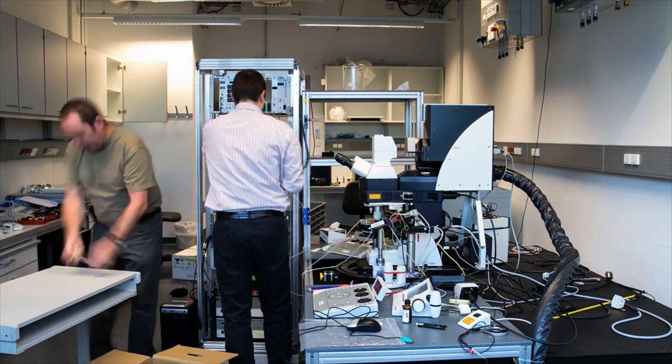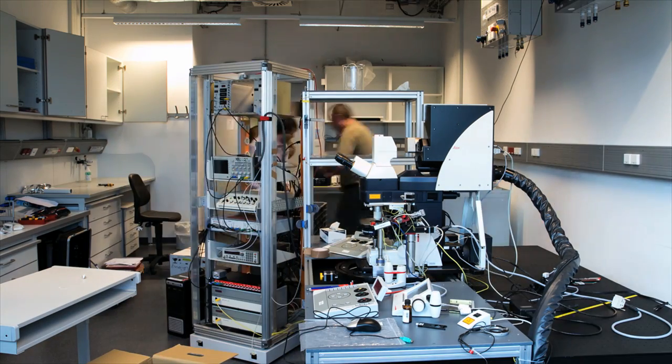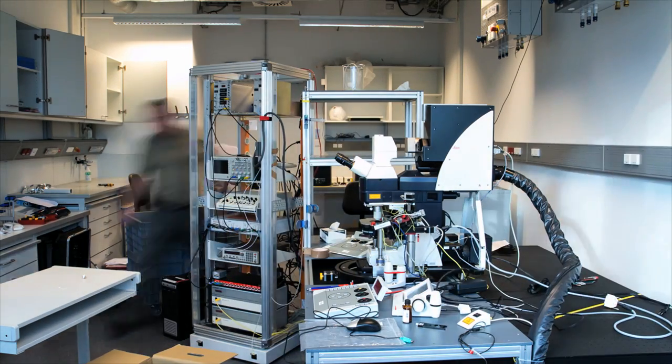In the early days of electrophysiology, the equipment was relatively simple. An amplifier, a microscope, and a micromanipulator was needed.